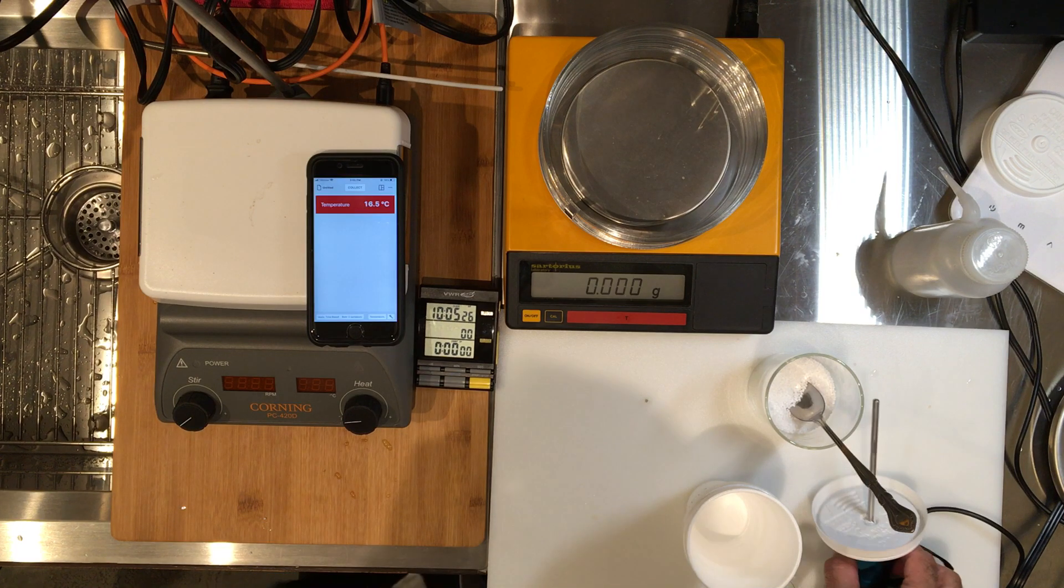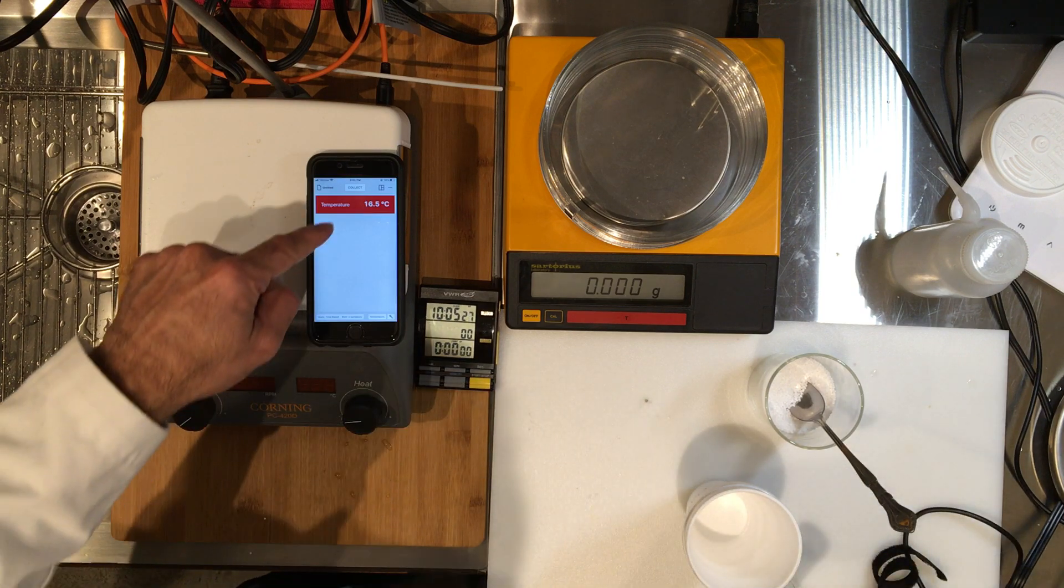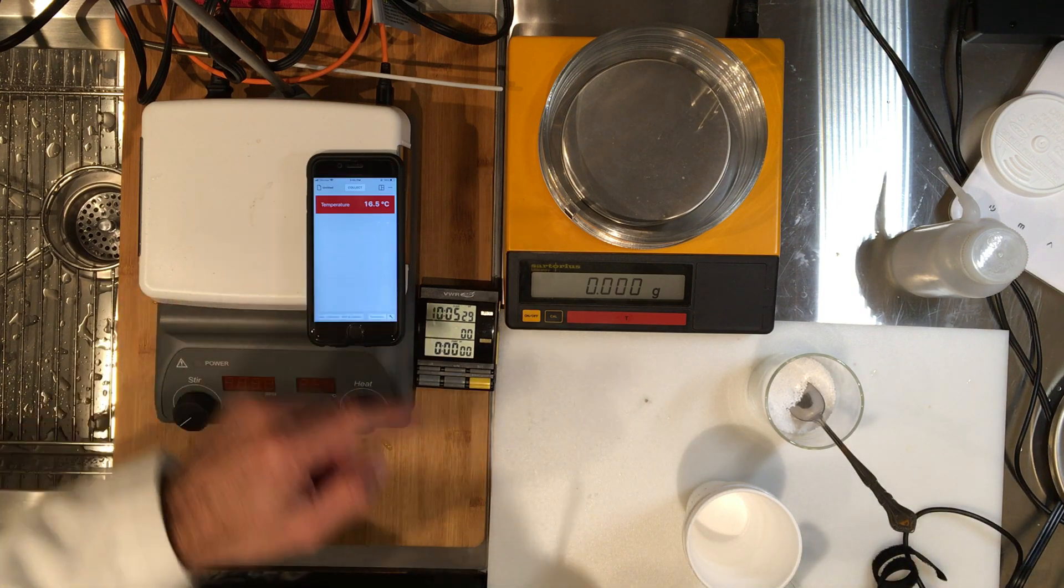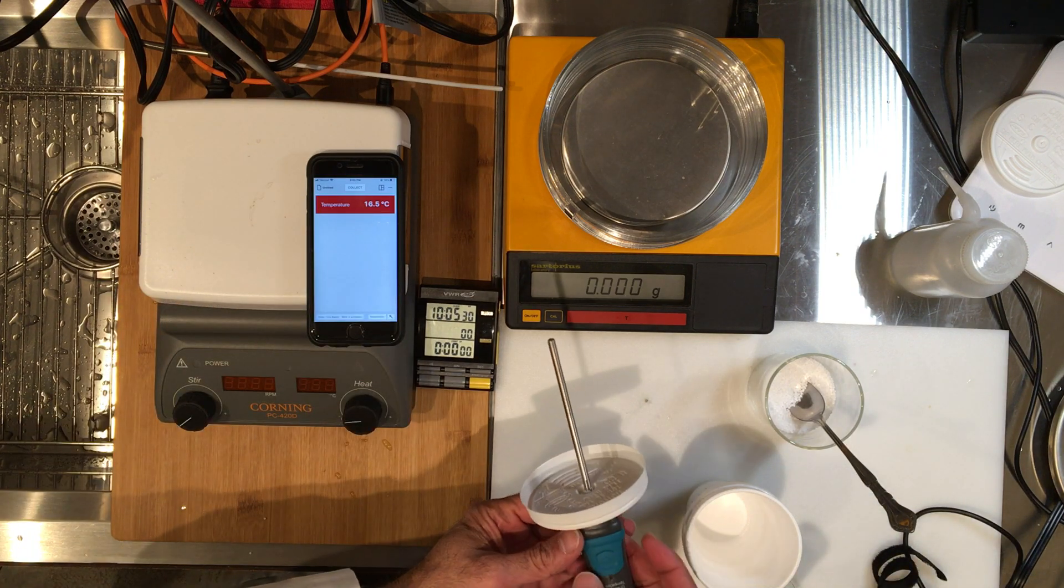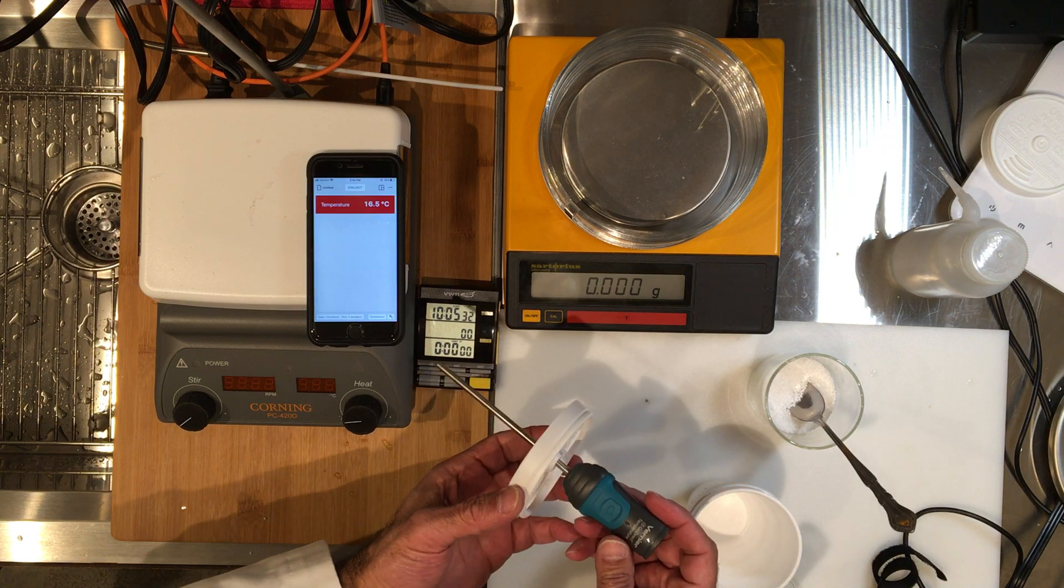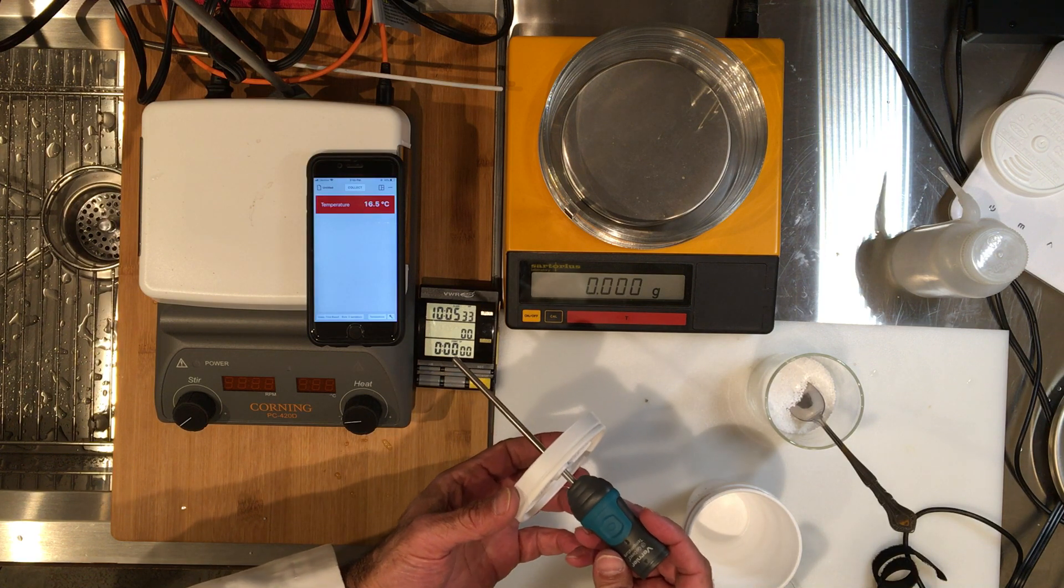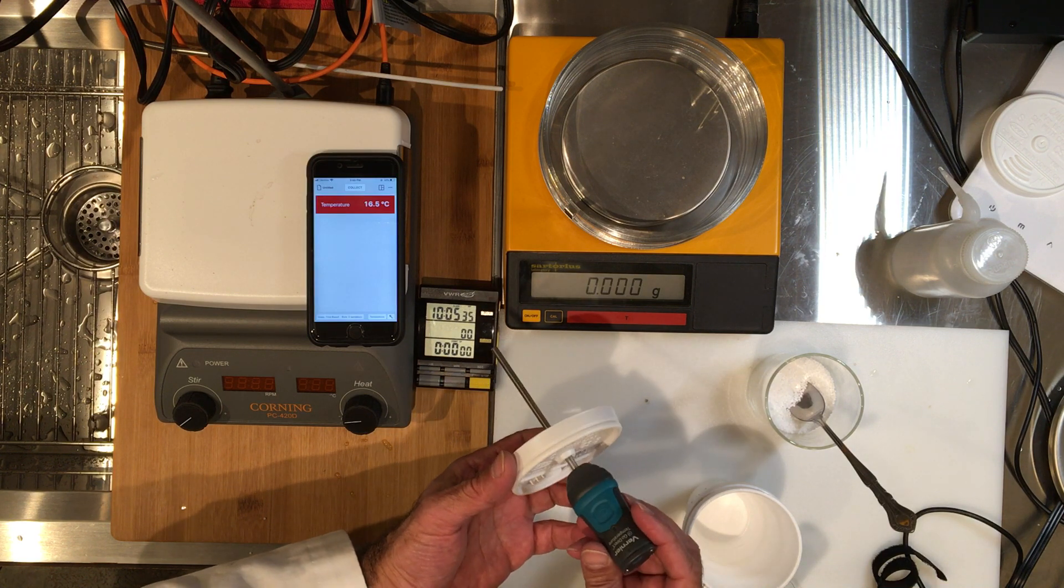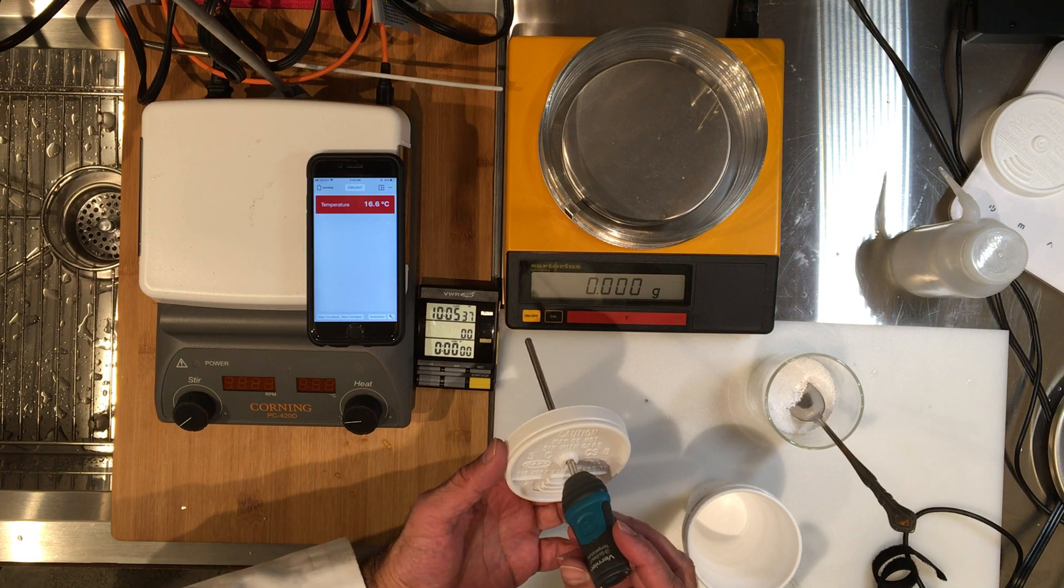Right now my thermometer reads 16.5 degrees Celsius. This is a wireless thermometer, very convenient, and I've inserted it to a styrofoam lid.